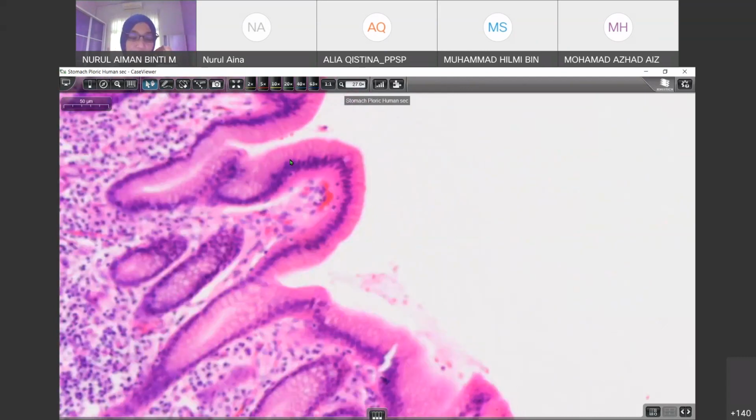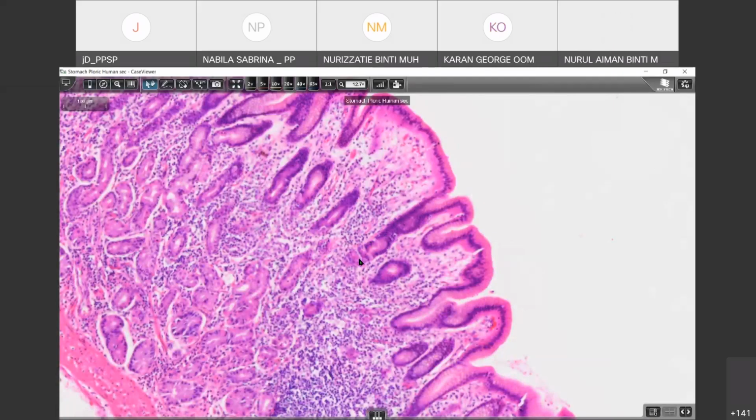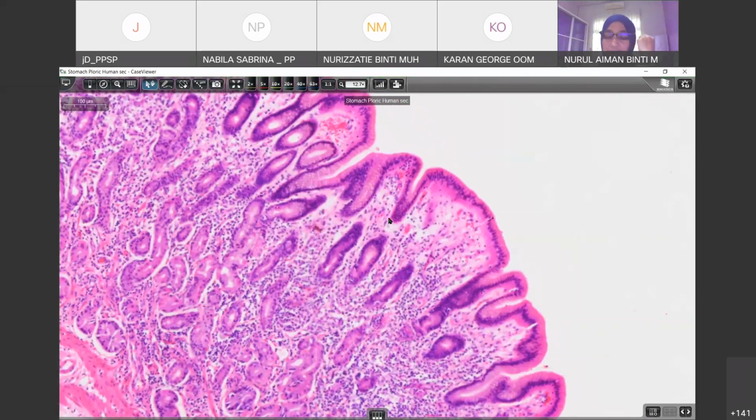You have to know, it is known as the glands. There is invagination of this epithelium inside the stomach and most of the GIT system. This is invaginated inside and it is forming this simple tubular gland.